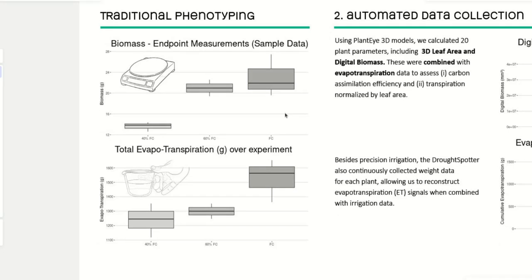In addition, traditionally, the irrigation would have been done by bringing plants to a weighing station a few times a week and maybe topping them up to their target weight. At the end, one would sum up the irrigated volumes and then have the total evapotranspired volume.